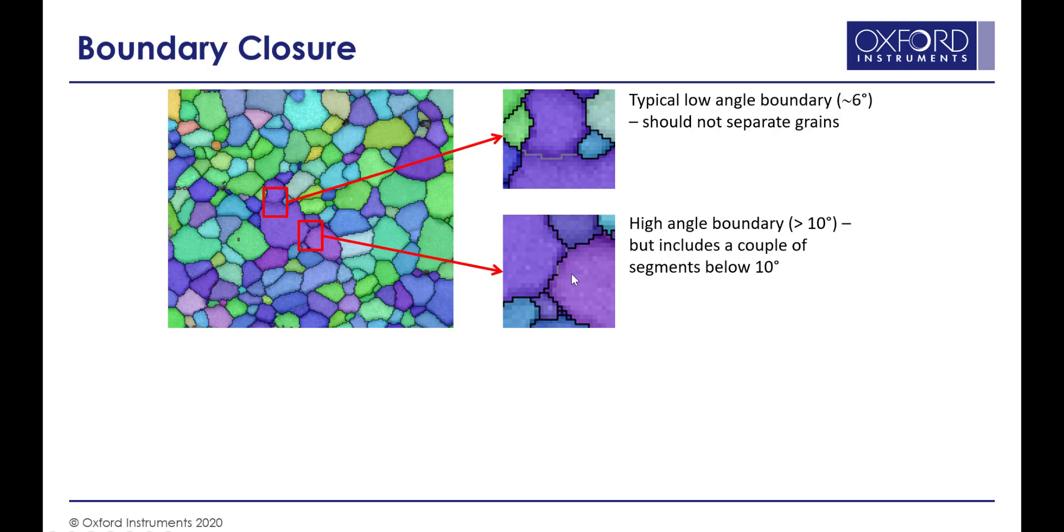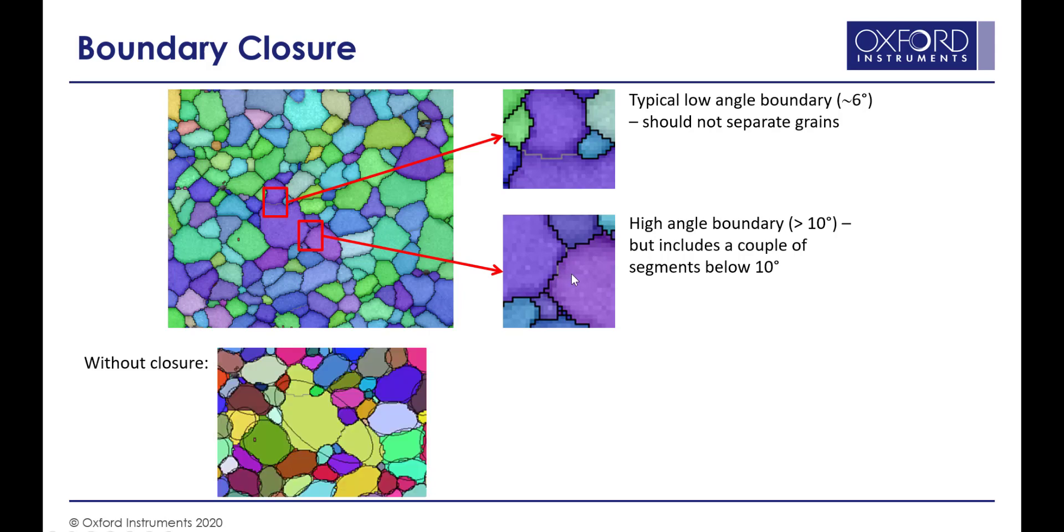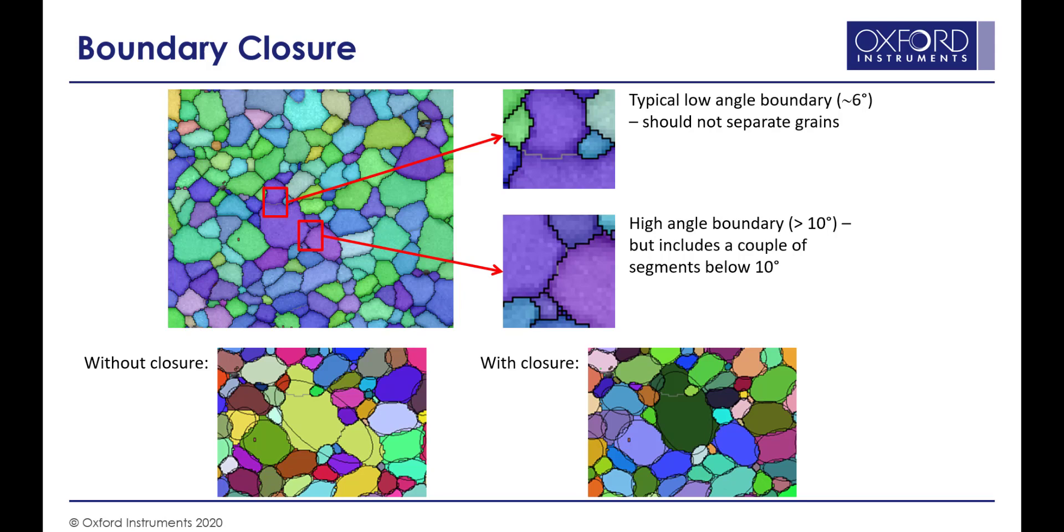With the normal flood fill algorithm, all of these three domains will be picked out as the same grain. If we include the boundary closure, what the software will do is consider whether it should cut off some of those boundaries. For this upper subgrain boundary, it makes a decision that this should be included as part of the same grain.